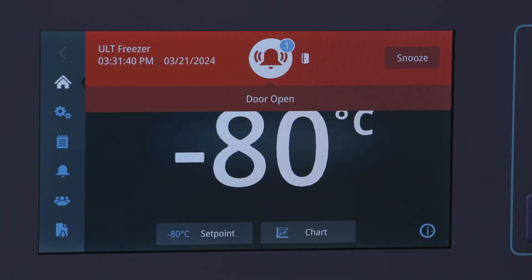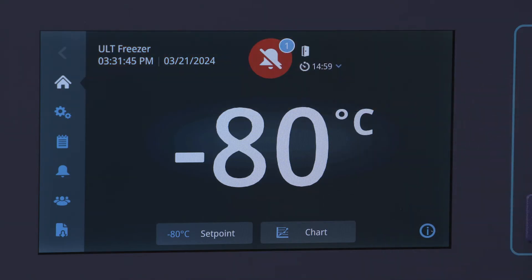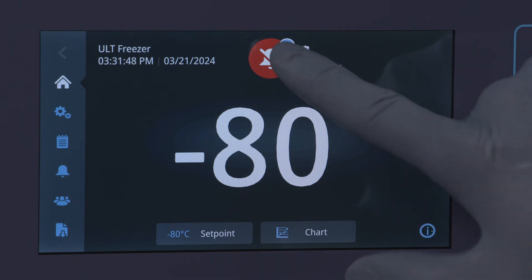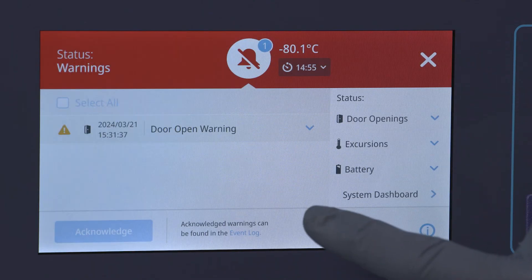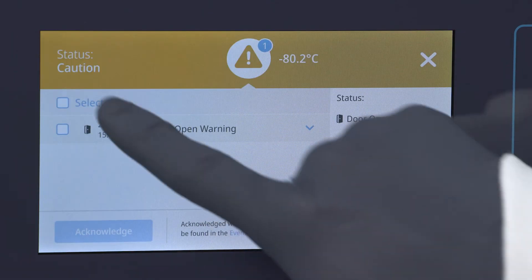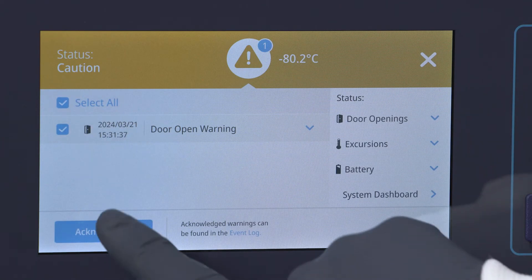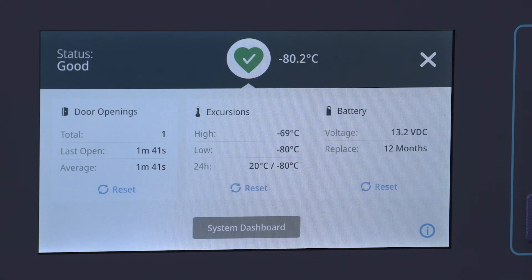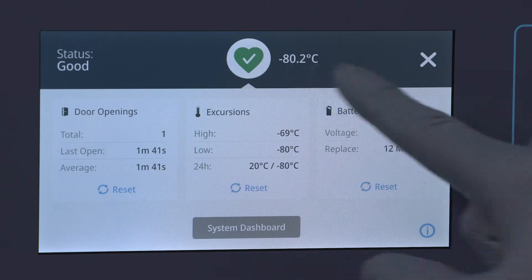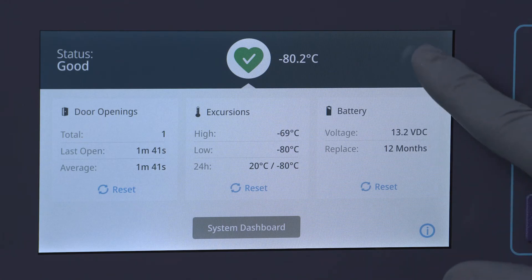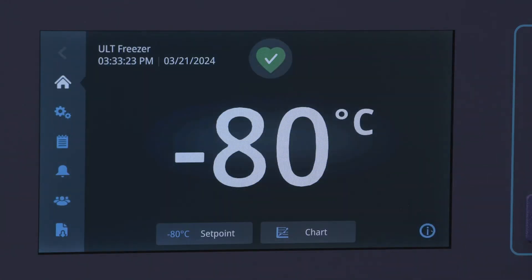The TSX Universal ULT Freezer features various events like cautions and warnings. A warning would indicate events like temperature excursions or prolonged door openings, while a caution would be a notification or suggested action. Cautions and warnings can be acknowledged via the event log. Once the warning or caution state resolves and is acknowledged, the health indication status will return to green.